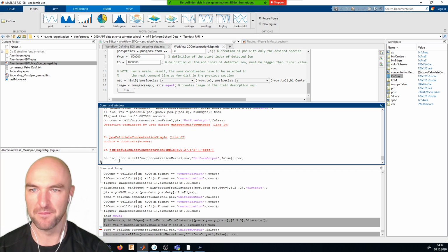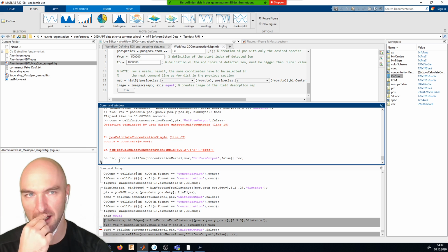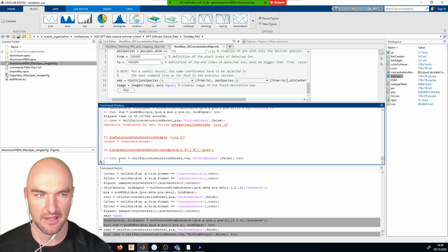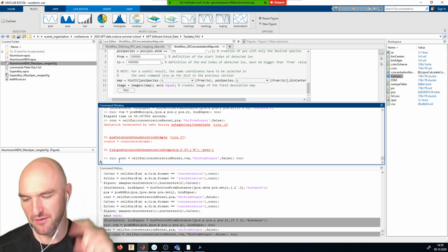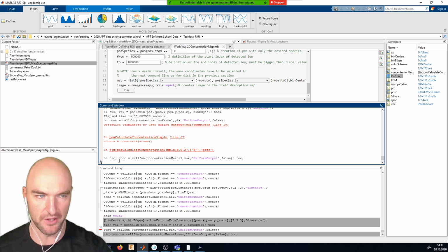Anyway, what I showed you right now is actually the slow version, and I will show you a faster version for the voxelization. The slow version has the upside that once you've calculated the concentration, it's all there. All of the atoms, all of the concentration calculations and all of the information are there. So you will see which concentration you have, how many unranged you have, so you can voxelize the unranged ones. And once that's calculated, it's all there.